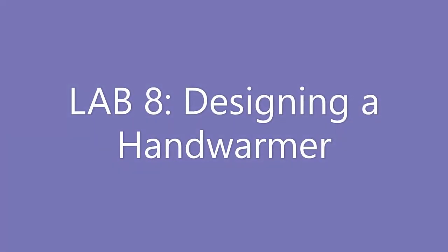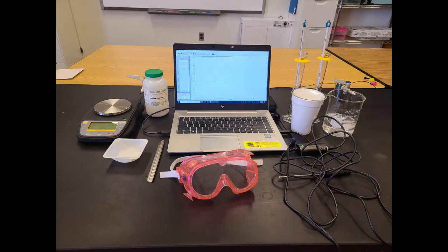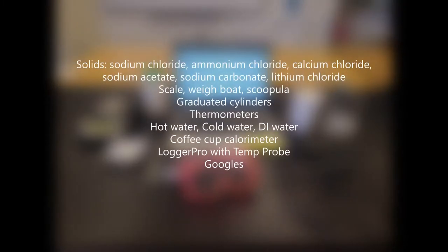Lab 8, Designing a Hand Warmer. Here are the materials that you will need for this experiment.